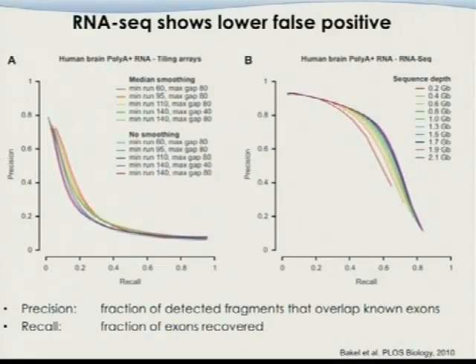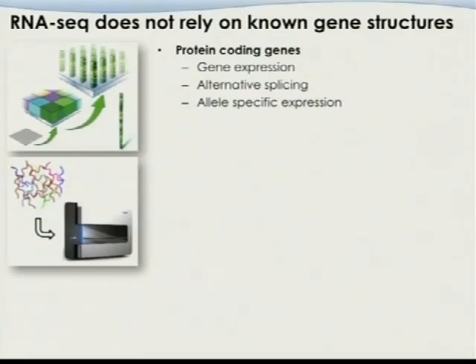Oh, this is the analysis methods. They compare it. They can do a certain level of normalization, whether they do RMA or not, we don't have to get there. But this is a different level of analysis. And this is actually a very hard paper to read, published last year in PLOS Biology. They also have a few other papers, but this is a really, really important figure for you to study. So just get it, and think about how you will put that into the Encore system. So just take a look at that.